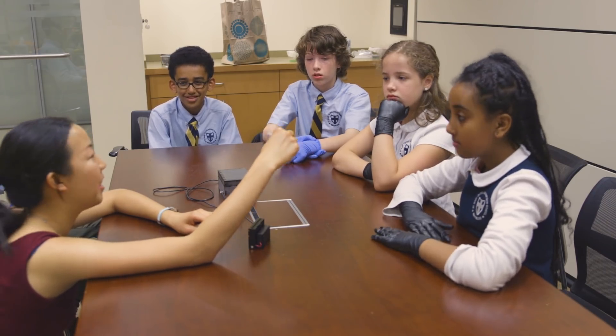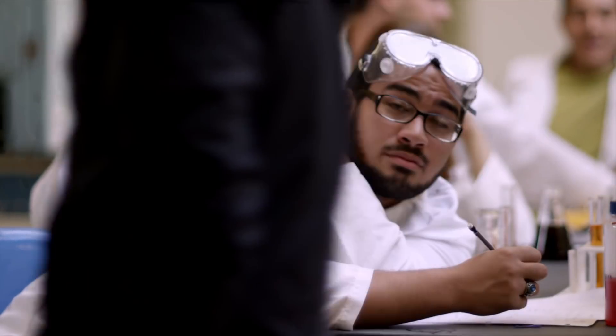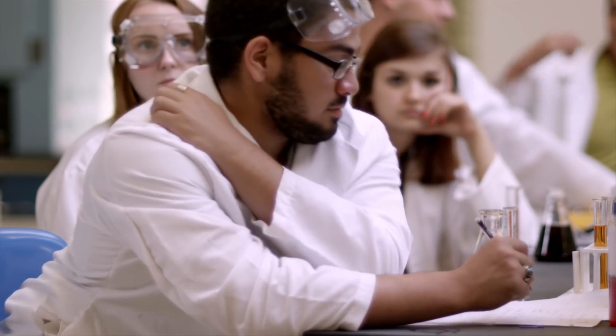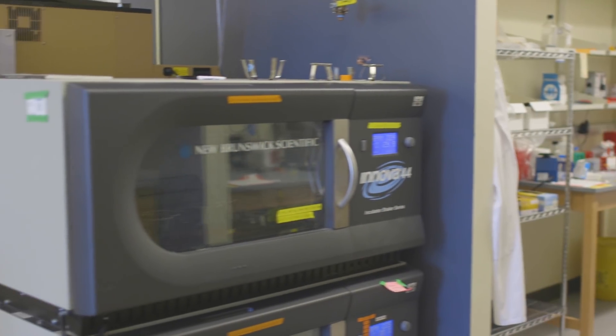To engineer biology you need complicated equipment, you need fancy labs, and as a result most middle schools, most high schools and many colleges are not actually appropriately equipped to teach kids the basics of synthetic biology. These schools are struggling with STEM funding already, and now you're asking them to basically have all the equipment they need for a BL1 lab — things like freezers, refrigerators, and incubators that shake.